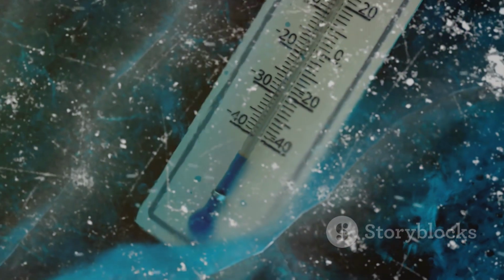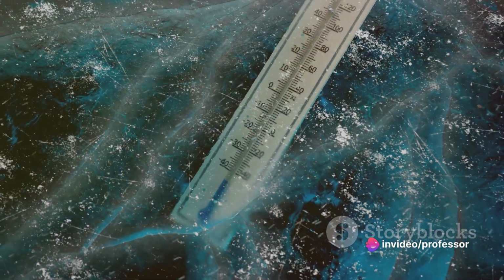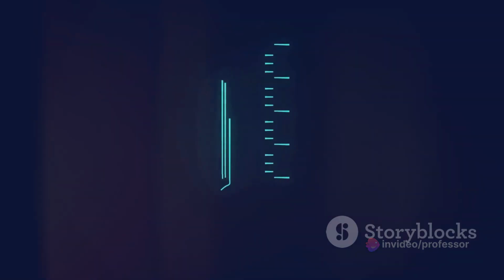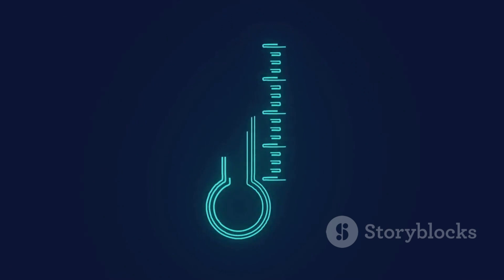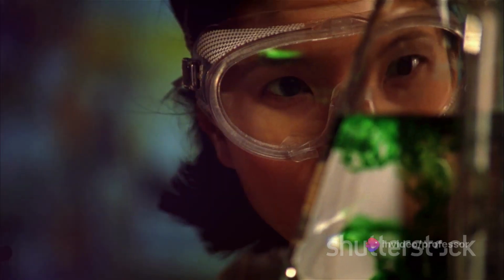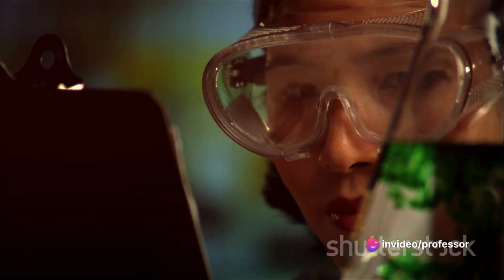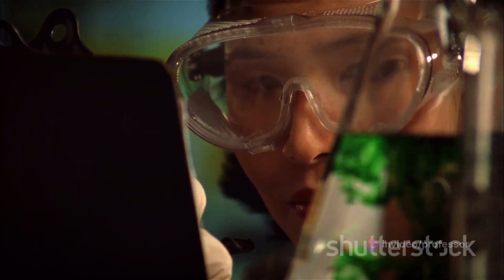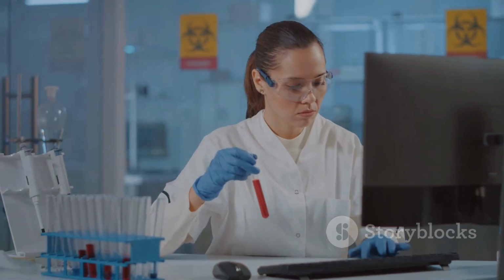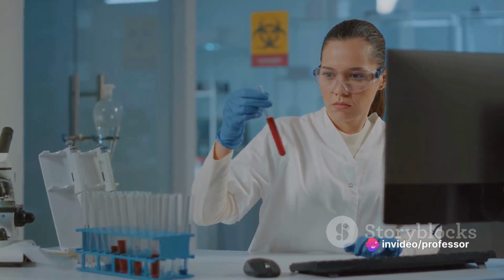Here's a fun fact. Did you know that the conductivity of a solution not only depends on the nature and concentration of the ions, but also on the temperature? That's right. Conductivity increases with temperature, and most conductivity meters have a built-in temperature compensation to account for this. So, in essence, a conductivity meter and conductometric titrations are vital tools in the conductometry toolbox. They offer a unique and powerful way to measure and analyze the properties of various solutions, aiding our understanding of the world around us on a molecular level.